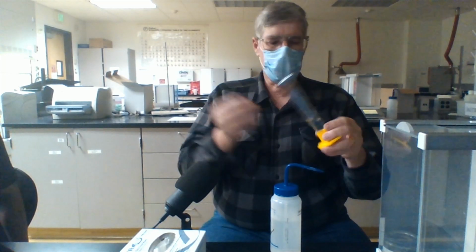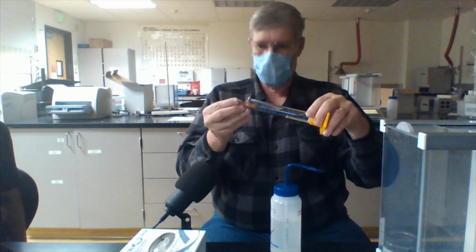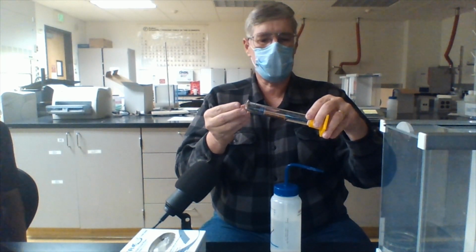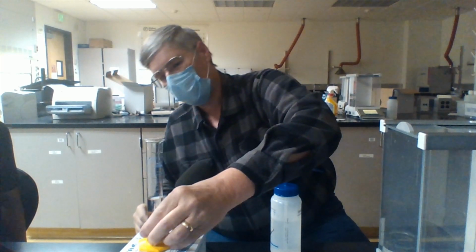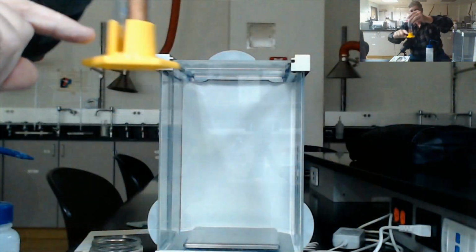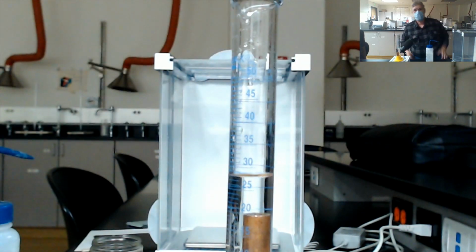To add this metal cylinder without breaking the graduated cylinder, we have to very carefully slide it in so that it goes into the bottom like so. And now we can see that the volume has increased, and we just need to precisely measure that.